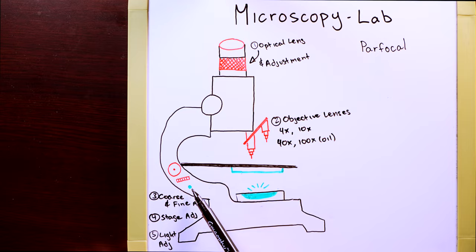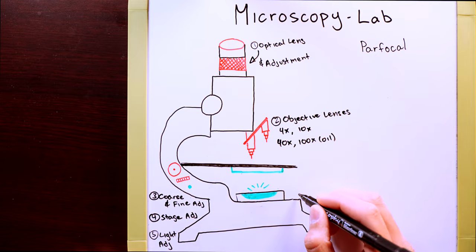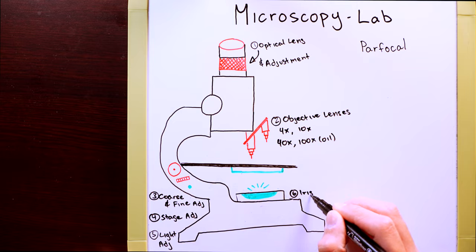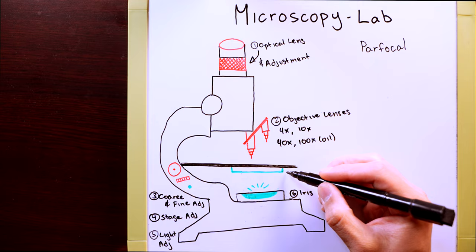There are some microscopes where you have a light switch as well as a knob. The switch simply turns on the light. The knob controls the intensity. The light will then go through the iris at the bottom of the microscope, which is very similar to the iris in your eye, in which it controls the amount of light going through it up into the condenser here.